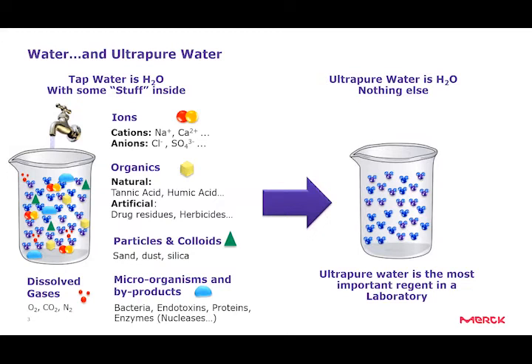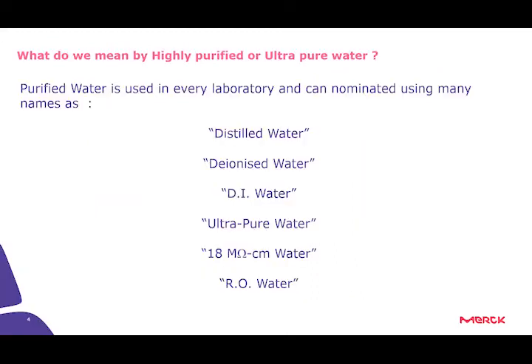Particulates and colloids like sand, dust, silica, microorganisms and byproducts such as bacteria, endotoxins, proteins, enzymes, and nucleases. And also dissolved gases could be part of these contaminations such as oxygen, carbon dioxide, and nitrogen. Whenever we are talking about ultra pure water, it's H2O and nothing else.